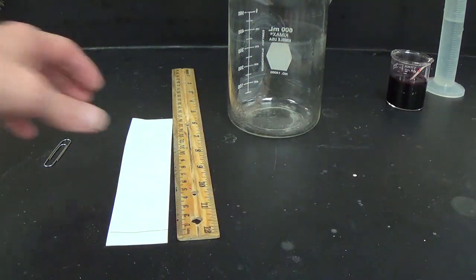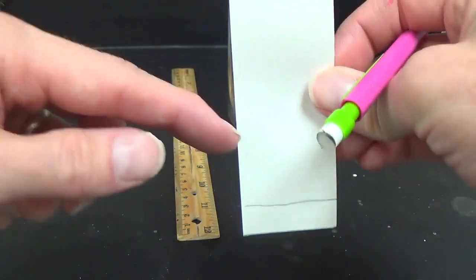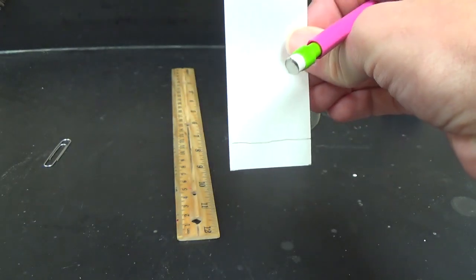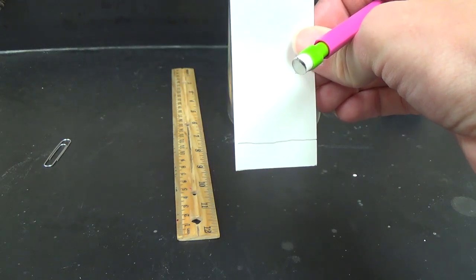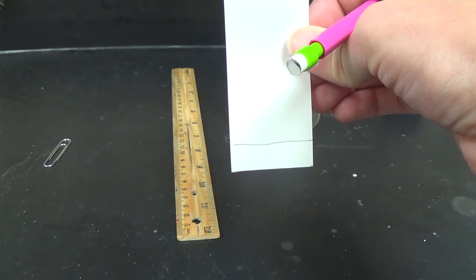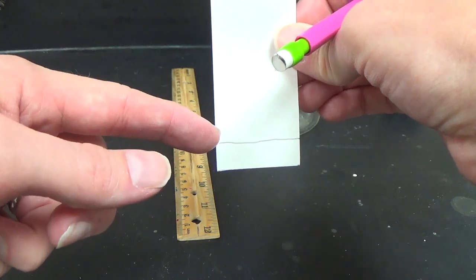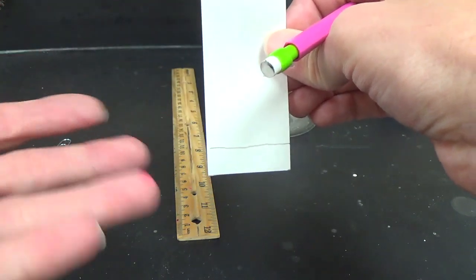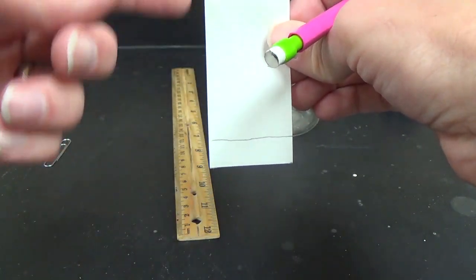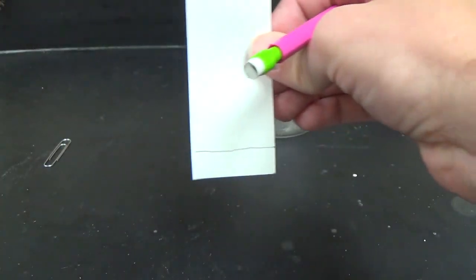Okay, and the reason I'm using pencil for my starting line, here you can kind of see it. The reason I'm using pencil for my starting line is I know that the pencil will not dissolve in my movable phase. That would be an issue. Then I would be separating what's in the pencil instead, so don't use pen. If the pen were to separate, then you'd get pen interference with what you're trying to separate.